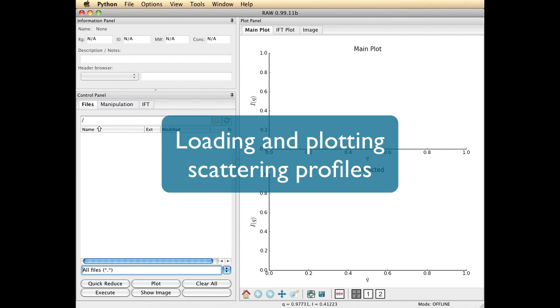In this first demonstration, I'm going to show you the very basic tasks that you'll need in order to use RAW, loading some small angle scattering profiles and manipulating them and plotting them in the plotting window.